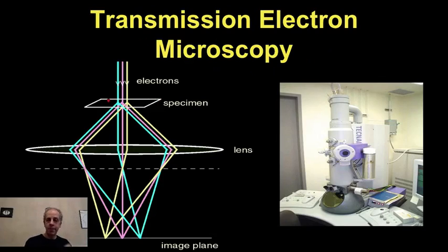We basically have a specimen with HIV, for example, but other specimens are possible as well. Microscopy is used all over for biological research. Electrons basically go, it's like you throw electrons into the specimen, and you let them just go through. Basically, you capture the image of the specimen by measuring how the electrons go through. And we see that in this diagram, there is a lens and there is the image plane. That's where things basically get captured.